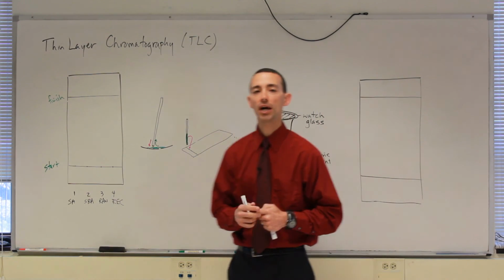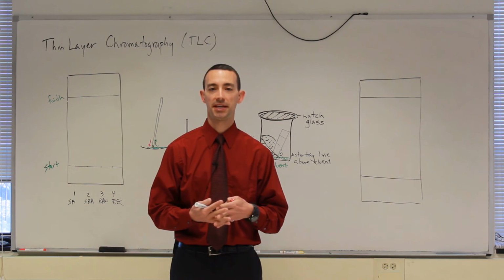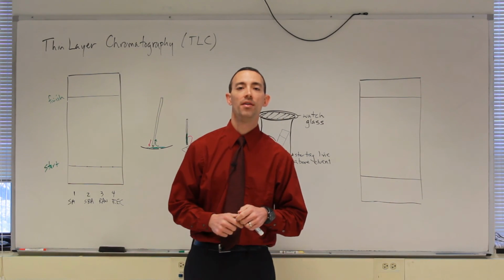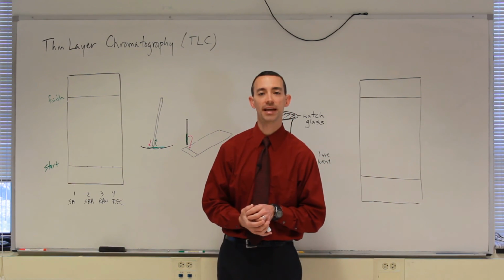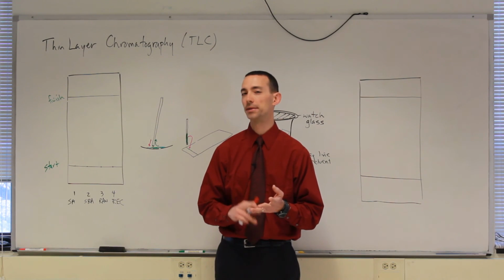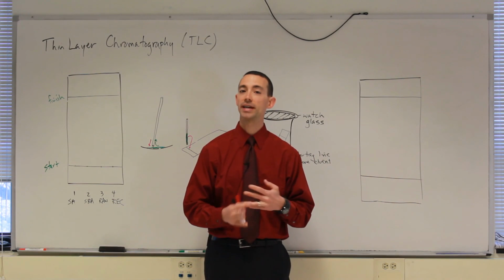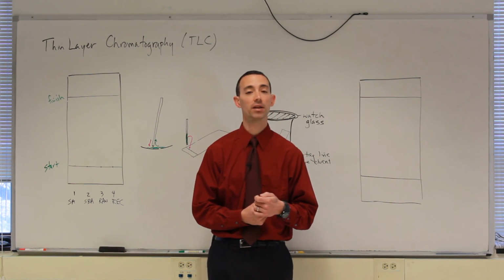Thin layer chromatography takes advantage of the different polarities that molecules have. Polarity is, of course, a topic that we addressed earlier this semester when we looked at intermolecular forces, and it's a result of the shape of a molecule and the types of bonds that are present and the electronegativity differences of all the different atoms that are in a molecule.